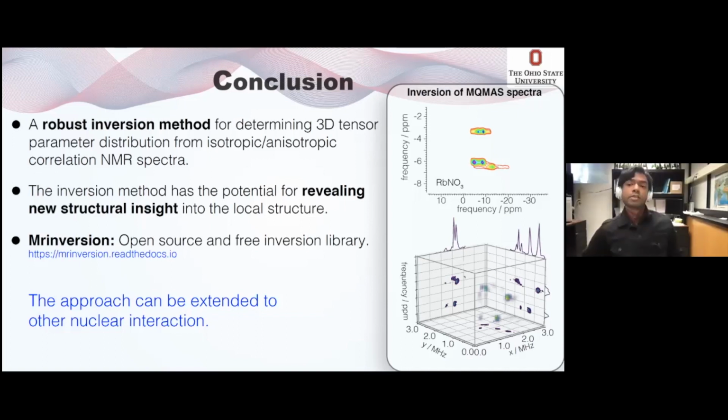At the moment, we don't have any regularization on the isotropic shift. That is something that can be added, but the issue comes with the resources at hand, because that regularization creates a massive kernel, which currently my personal laptop cannot handle. But yeah, that can be done, a regularization on the isotropic shift.